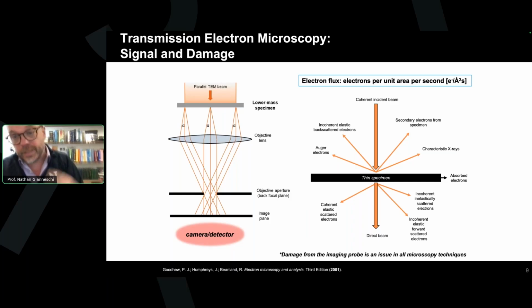So we're trying to form an image, trying to study material dynamically, hopefully capturing things that would also exist in, let's say, real life or outside of the liquid cell, that would then correlate with a bulk solution experiment, or wherein we can confirm that the chemical structure isn't perturbed over the time of imaging during the experiment. So that's the type of thing that we've been concerned with over the years.